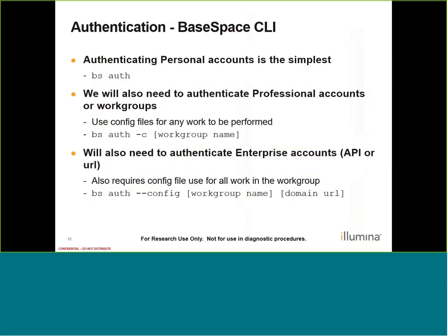I encourage you to use the actual workgroup name so that you can keep track of your config files, but you can name it whatever you like. To authenticate an enterprise account, the command looks like this: BS auth --config and then the workgroup name. Since it's an enterprise account, you also have to include that private domain or the URL for that particular enterprise instance.